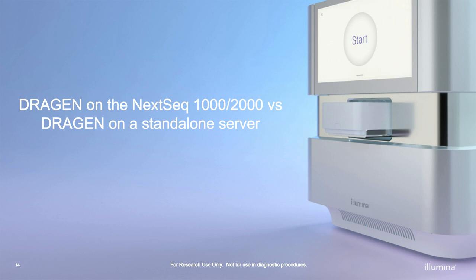Okay, so now that we have an idea of the different run modes, we just briefly want to talk about the difference between DRAGEN on the NextSeq 2000 versus the standalone server version of DRAGEN.